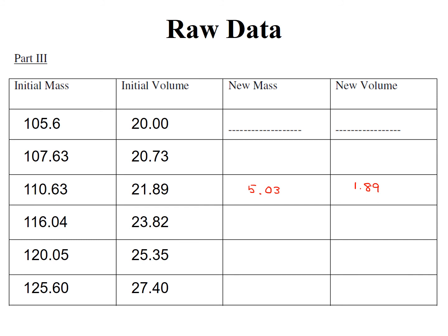Then what are we going to do here? We're going to plot this. Again, we have the volume on this side and the mass on this side, and you're going to calculate the density.